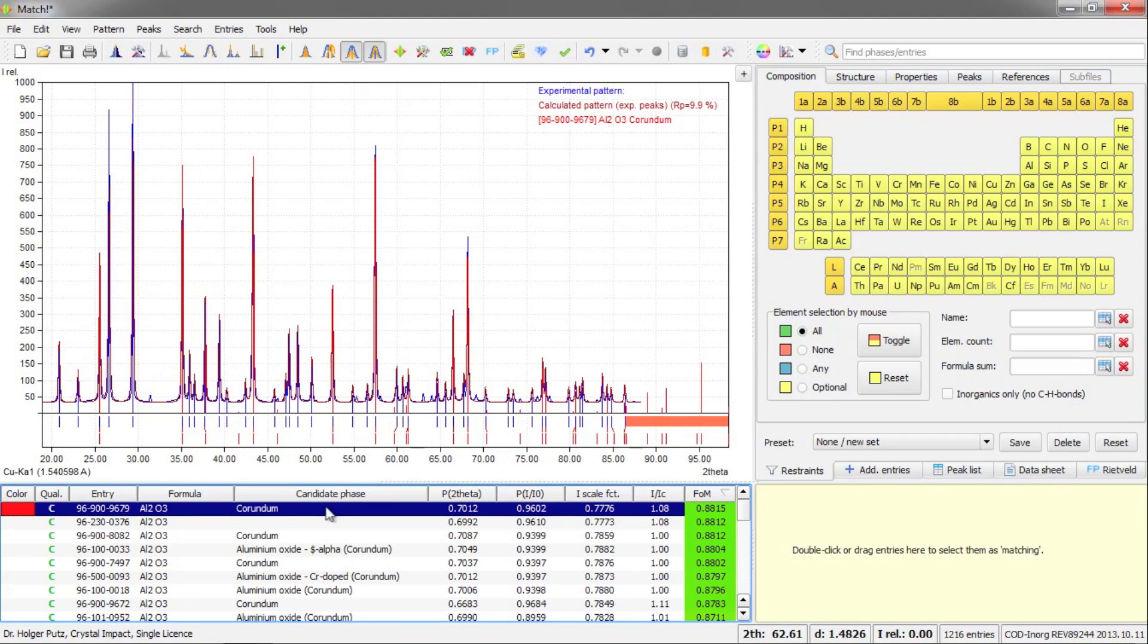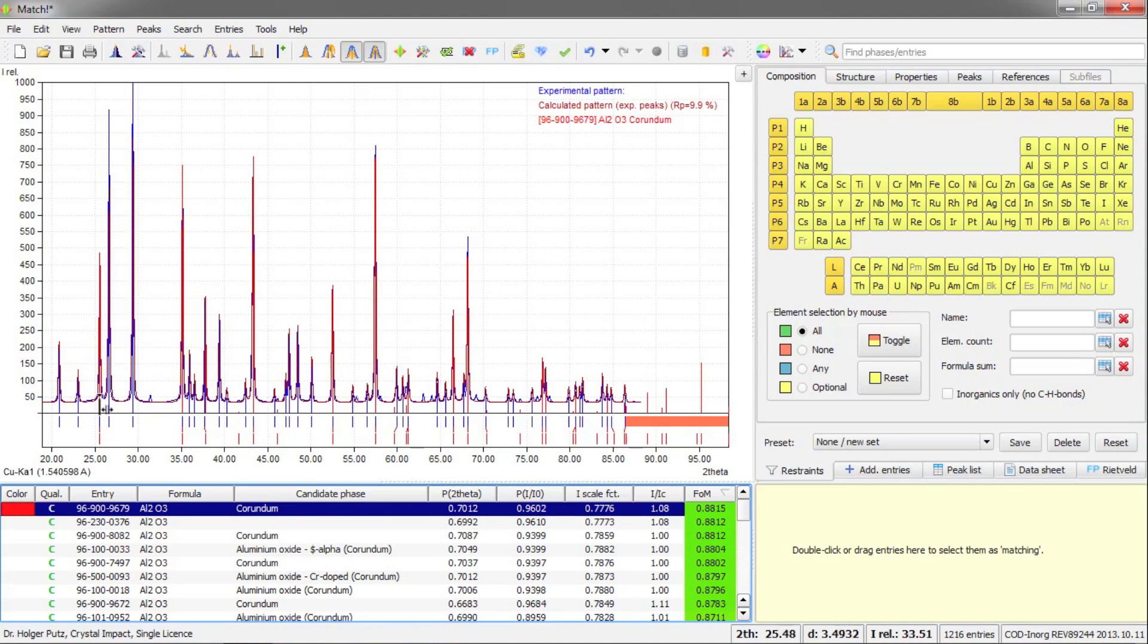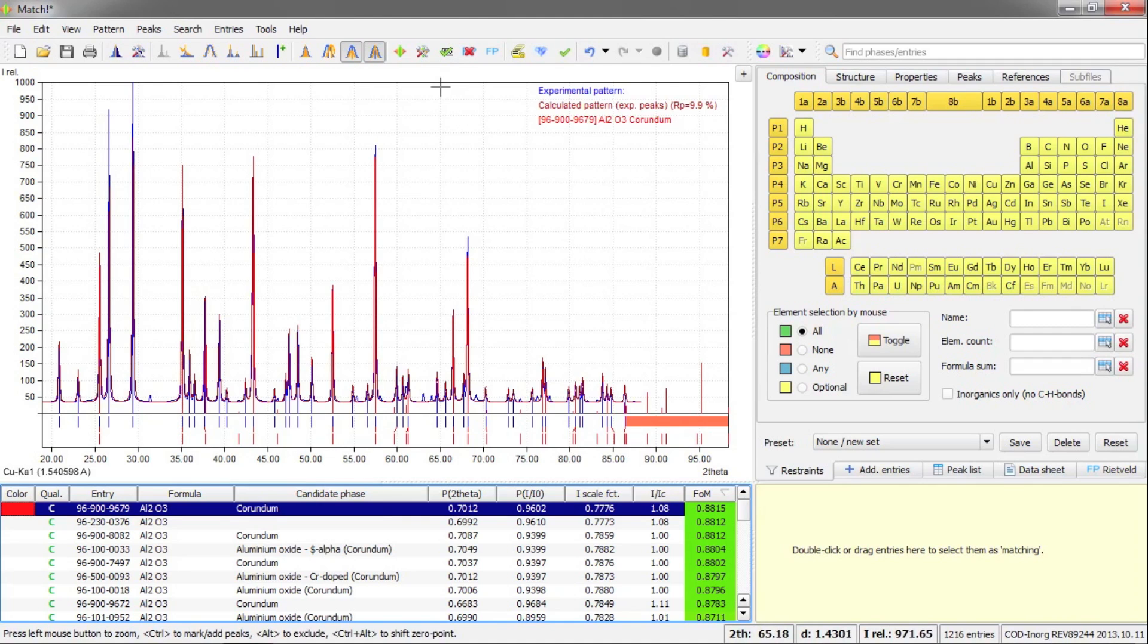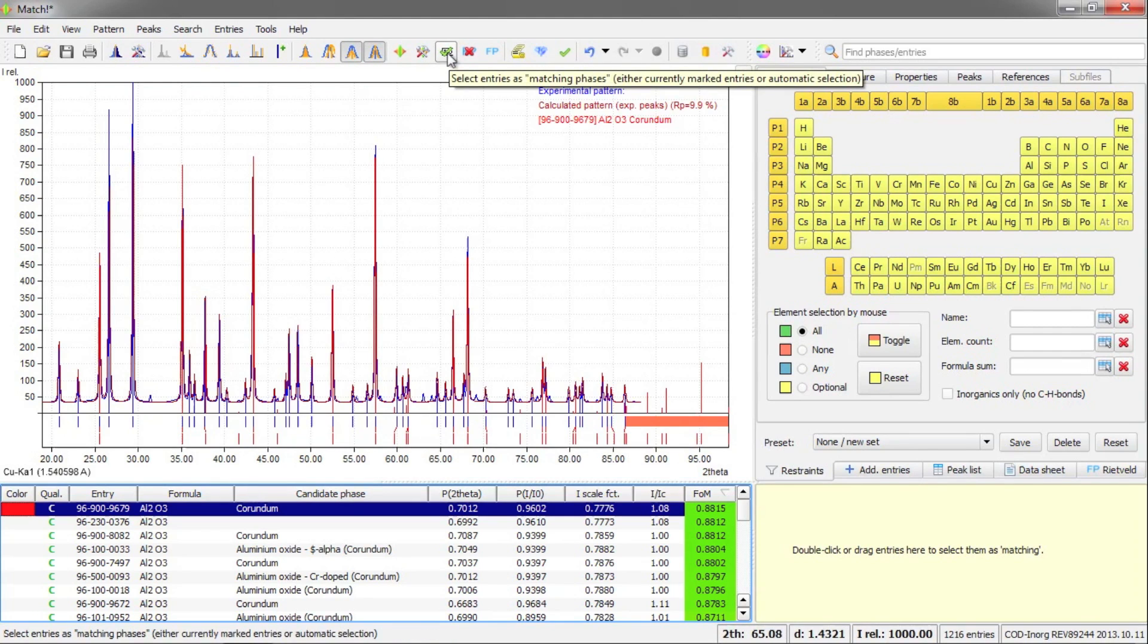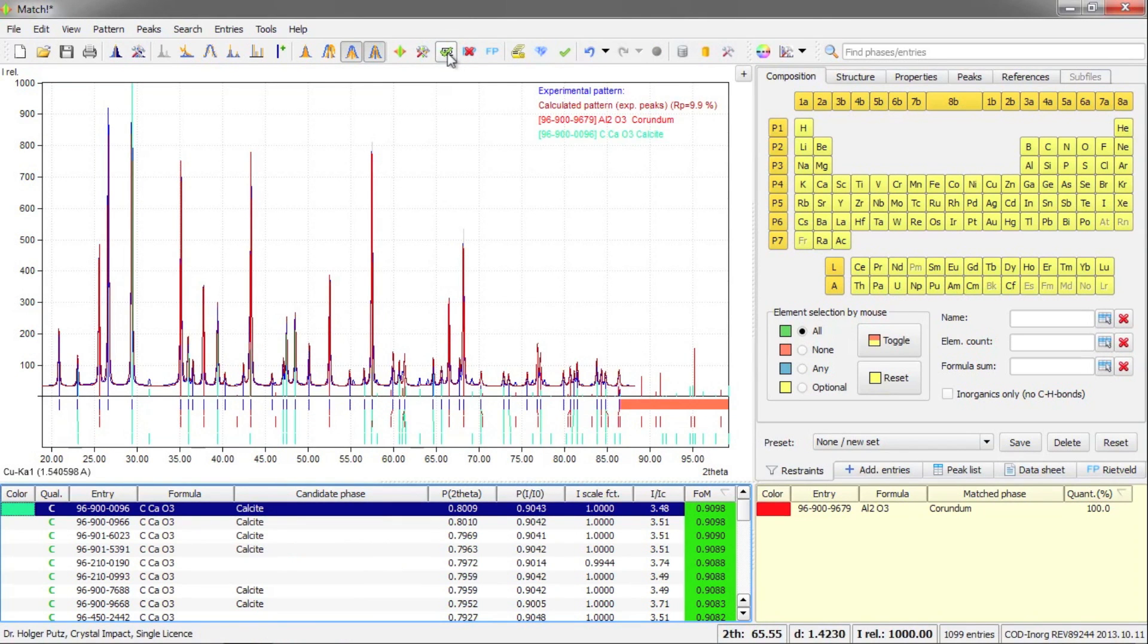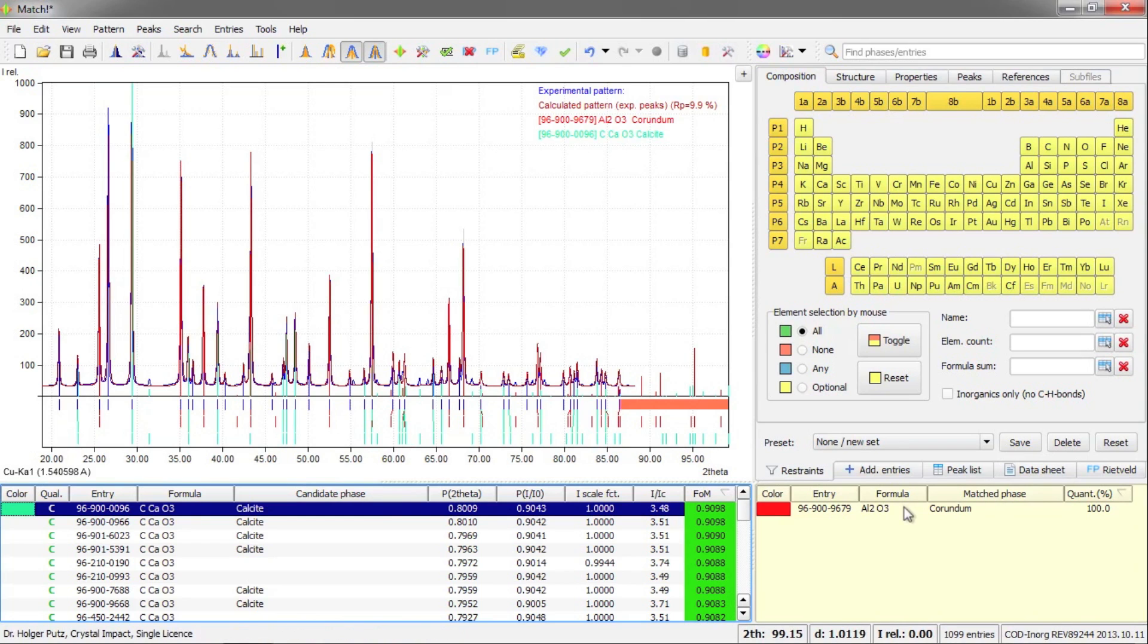In this case, this is corundum. And if I check the agreement between the red peaks and the blue curve in the background, this looks very promising. So I can accept this phase as matching. I can do so simply by pressing this button here in the toolbar. And now the entry has been moved to this table here on the right hand side, which is called the match list.